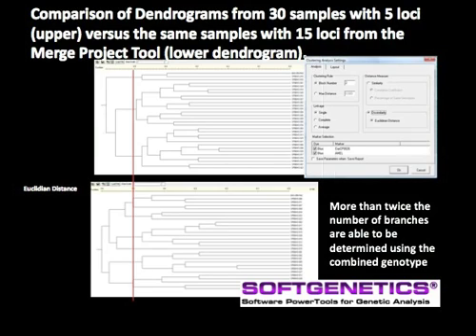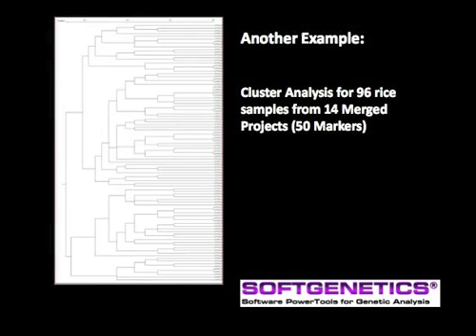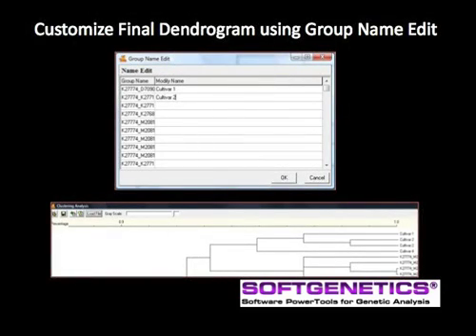Select the clustering analysis settings to customize the analysis for this application. The number of loci that may be combined is not limited by the program. In this example, 96 samples were amplified with 14 separate PCR reactions — 14 multiplexes — for a combined total of 50 markers used in GeneMarker's cluster analysis. The group name editor allows customization to replace file names with a descriptive name for the final print or publication figure.